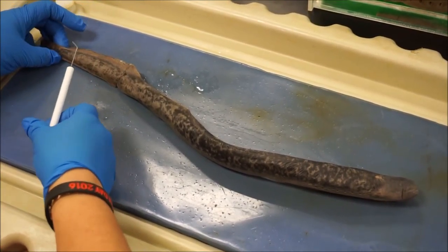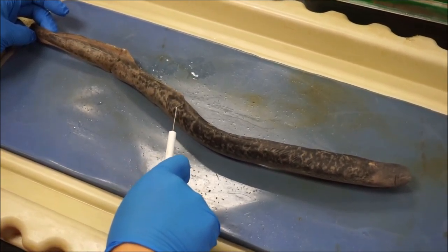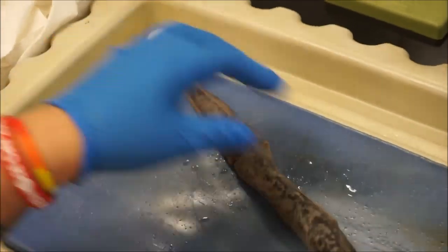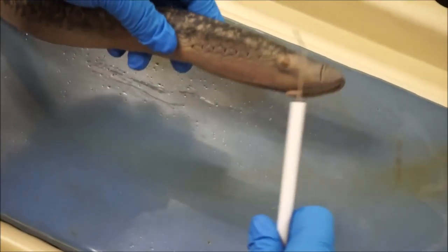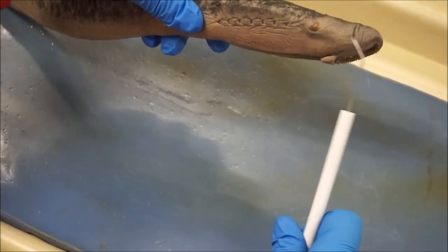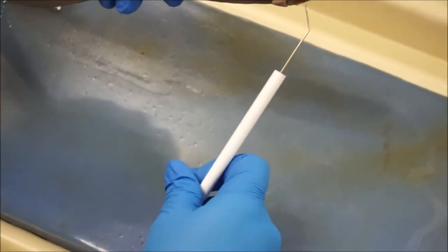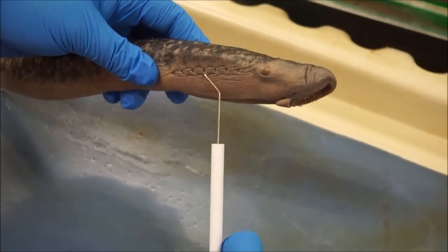In our tail region, we have our dorsal fins, right here and right here. And we have our caudal fin. In the head region, there are seven gill slits right here that are used for breathing and for feeding. When the water comes in through the mouth, it'll come out through the gills.